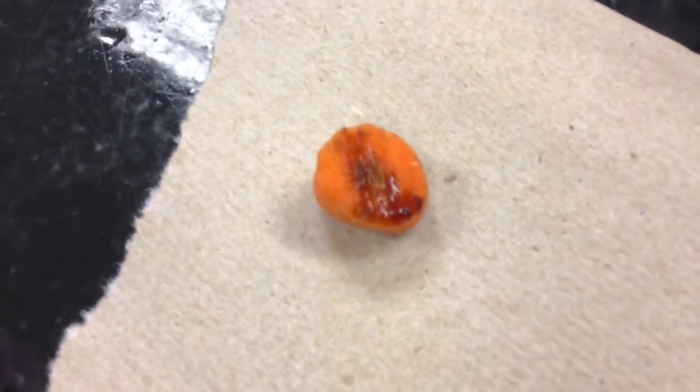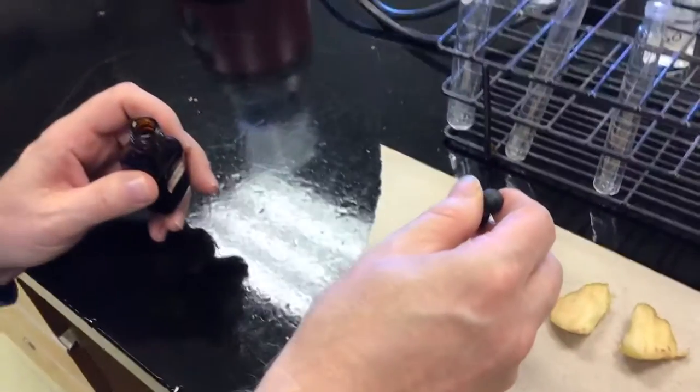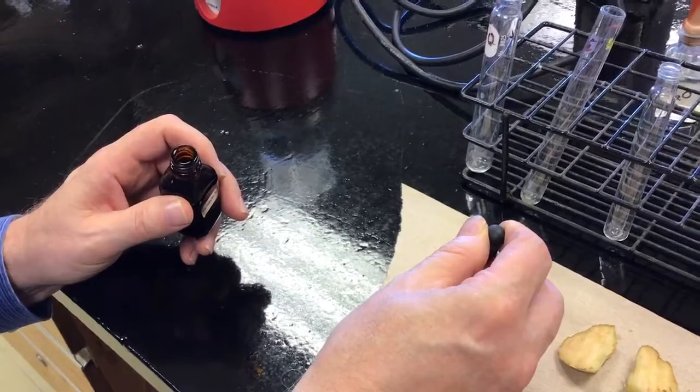Carrots are always tricky to read. Remember, Lugol's is very dark, and the middle of the carrot is kind of dark. I'm going to try another drop that hits the middle a little bit better.